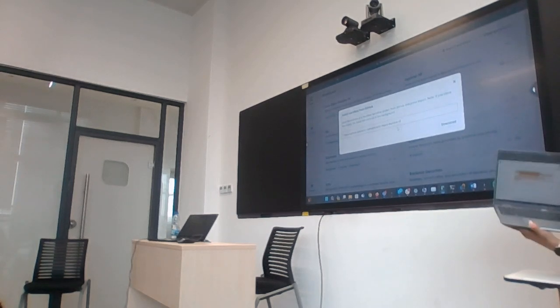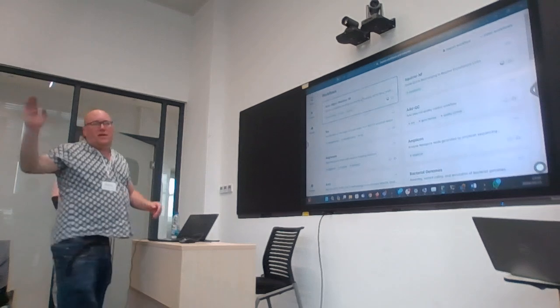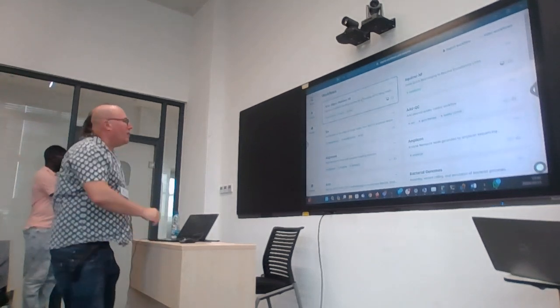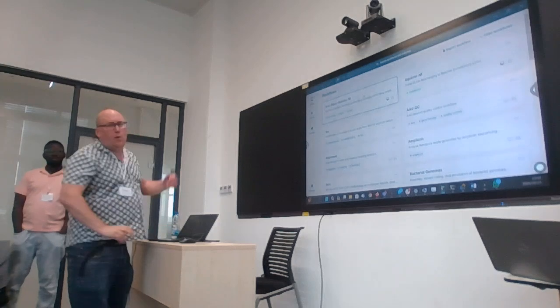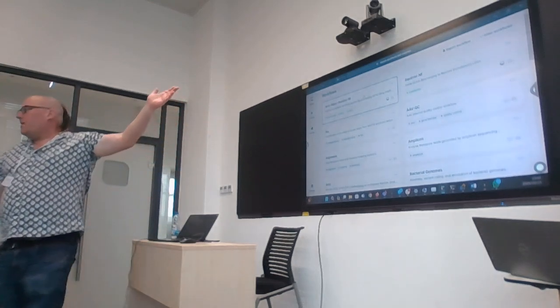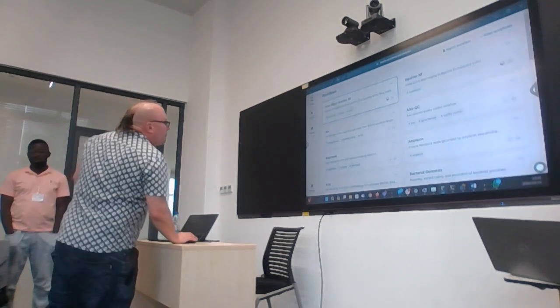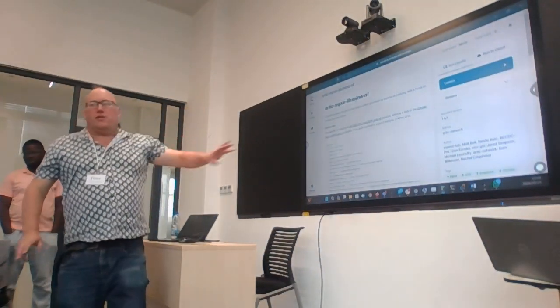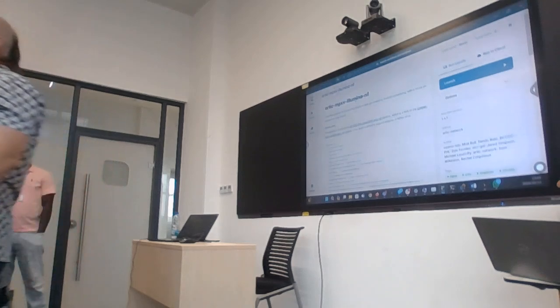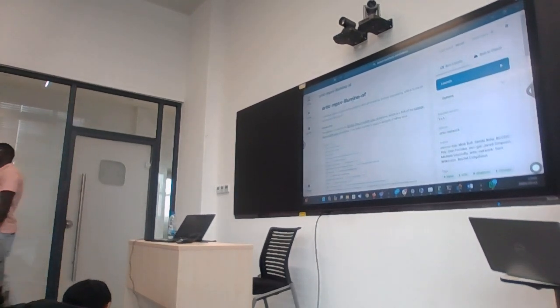So you go to Epi2Me. In this doc, I made a comment. This is to run the workflow. You can just go to the workflow that you've downloaded. It is here on your list. Then click it. You see? And then you get this page that describes the workflow, right? You are seeing this, okay.